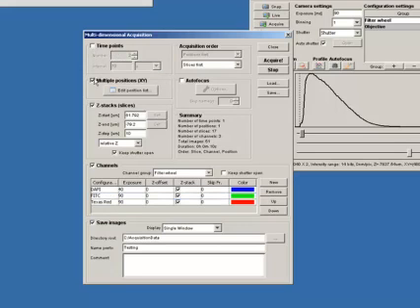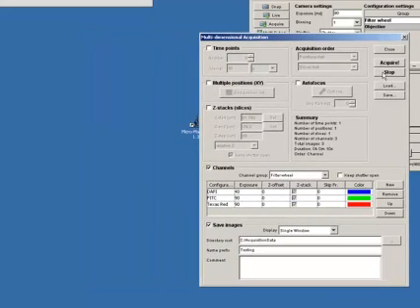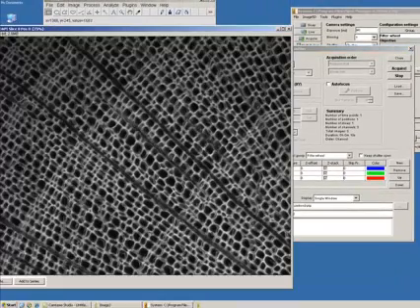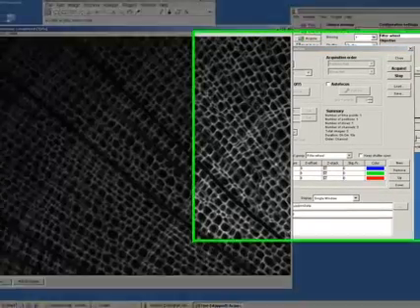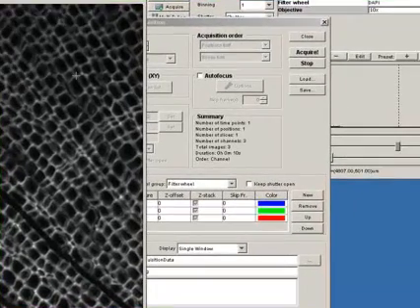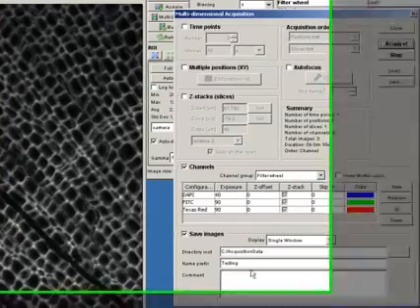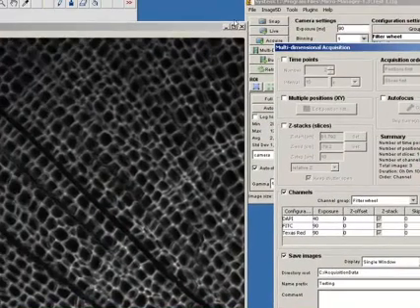So, if I turn off time, multipoint and Z-Stack. And just click acquire now. It should take a Dappy, Fitzy and Texas Red image in my current position. So, let's click go. And there's my three images that it's acquired. And we can review those now if we wanted to.